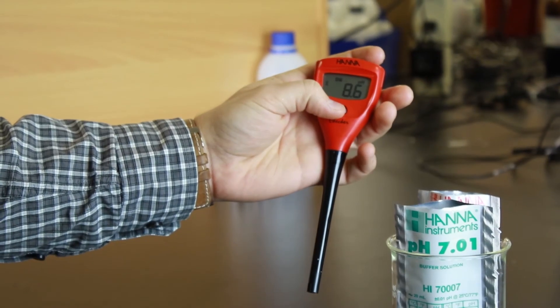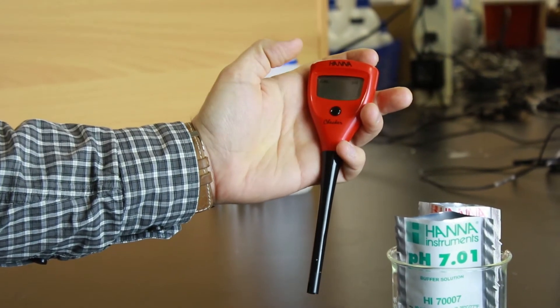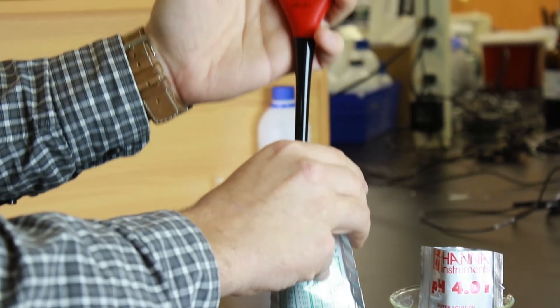Calibration is an important part for keeping your meter operating at its best. We recommend you calibrate before each use. To calibrate your meter, press and hold the button. Once CAL is displayed, the meter will prompt you to put it in either 4 or 7 buffer. It will automatically recognize which buffer you use first.